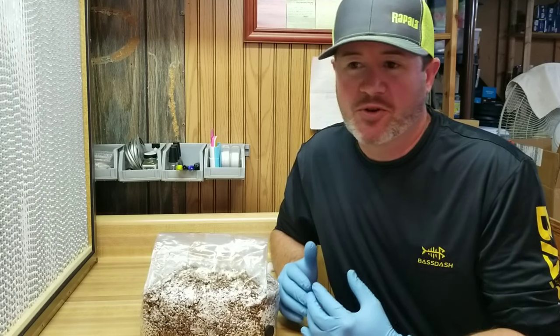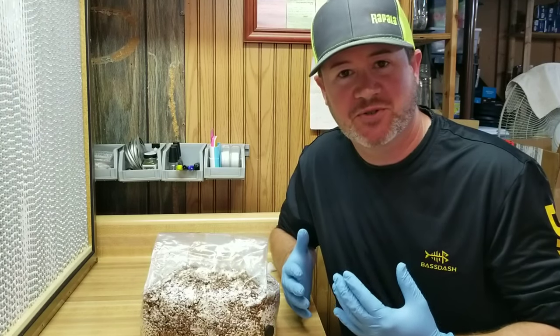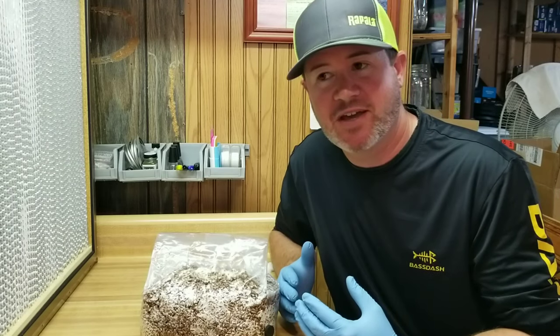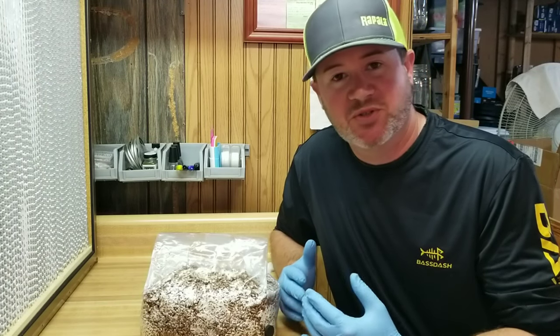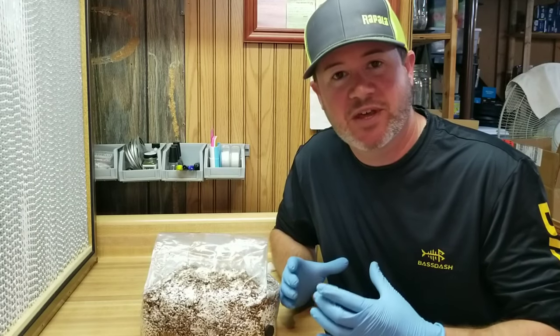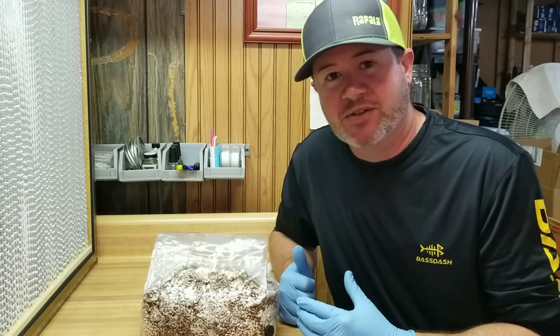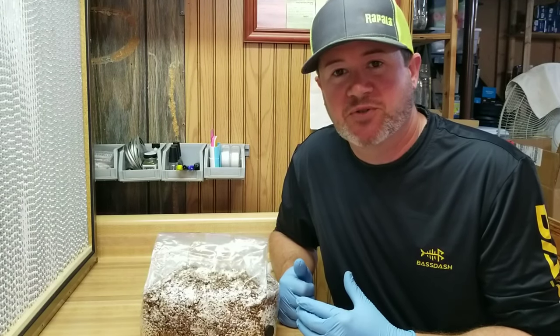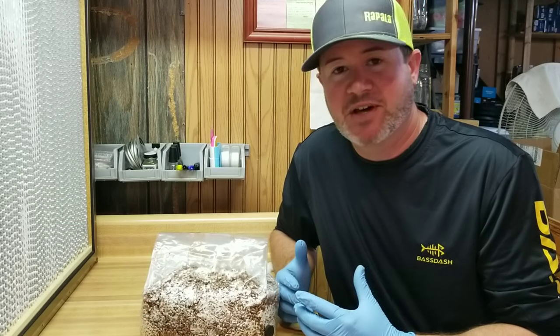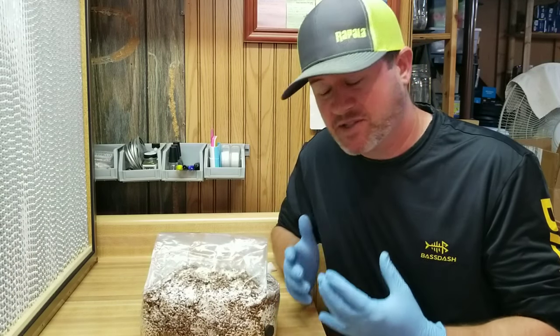In order to grow a species of mushroom, we have to capture culture somehow. There are a lot of different ways to do that — you can do tissue cloning of a wild mushroom or a store-bought mushroom, get some agar plates going, you can buy liquid culture from a liquid culture syringe supplier, there are a lot of those out there.